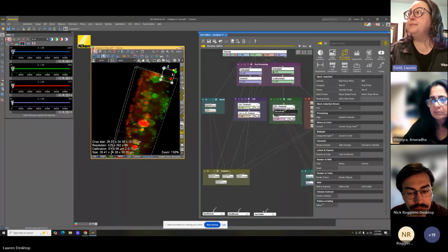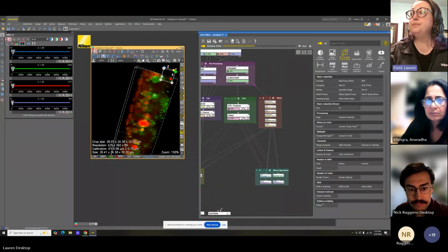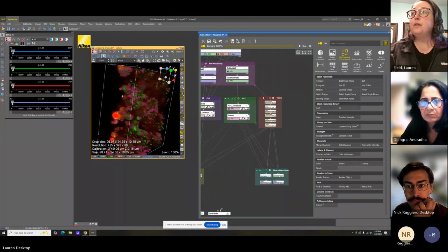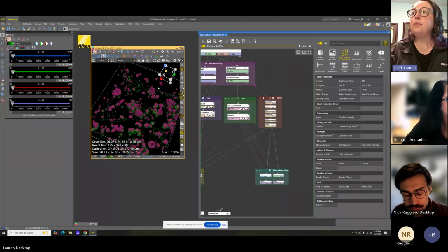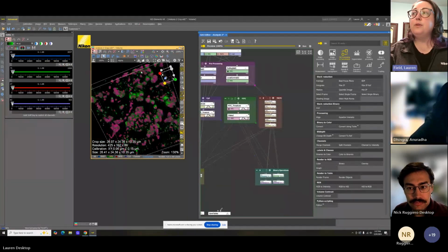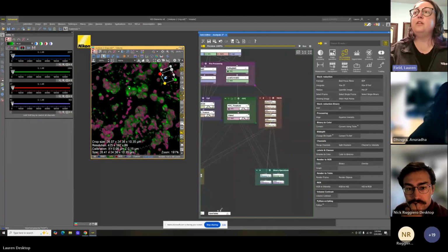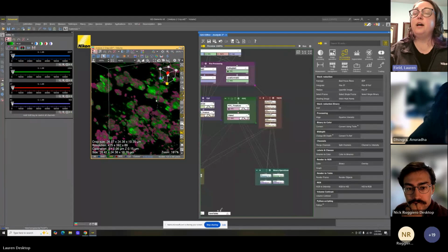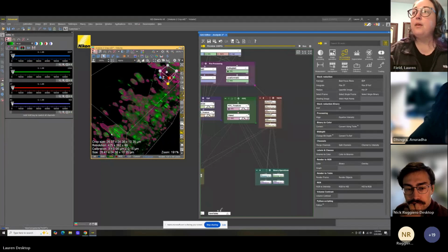For FITC, firstly, I made a threshold on FITC specifically. Green really quick so we can just see that. I was using the really bright center spots because when I started to drag this out a bit further, much more structures showed up in this process.